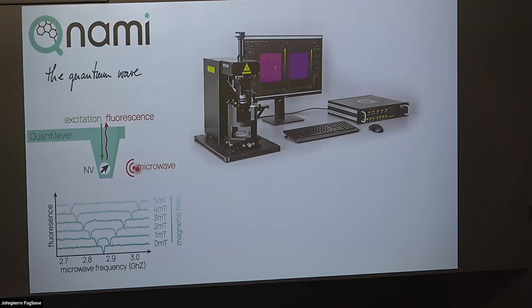What I've been told is basically, this is up to the user and what type of samples they're looking at. One of these cantilevers should last a very long time, but if you abuse it, it's going to take a toll. A little bit of gunk, I can imagine. Again, I'm not speaking from direct experience, just from what I know about science and the way this technique works. As long as that gunk does not shield the magnetic field, the big dominant thing it's going to do is change the mass, and probably change the resonant frequencies a little bit.